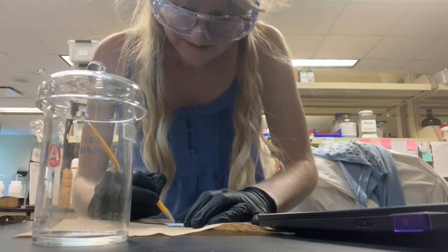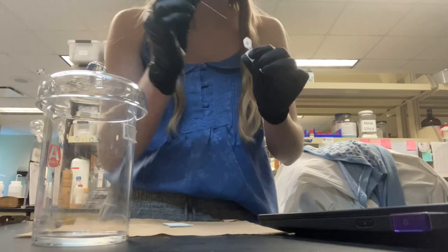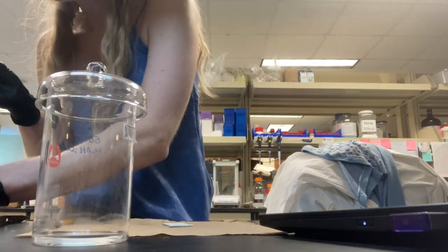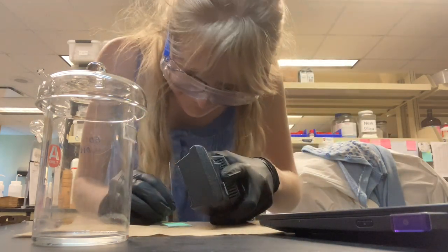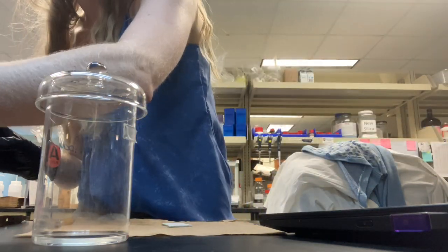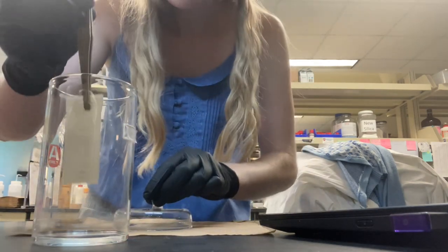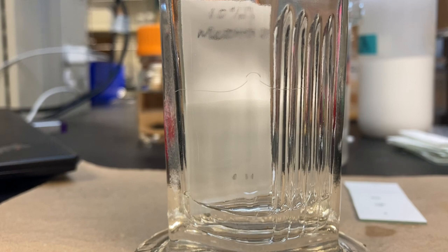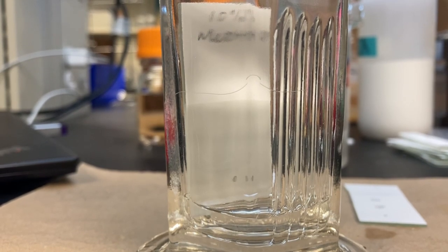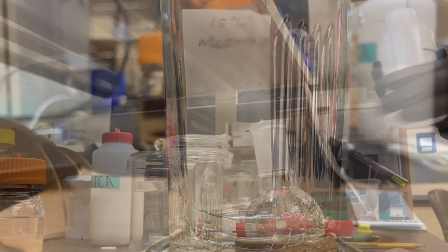In the afternoon, because my original plan failed, I had a crude product — a product that hasn't been purified yet — waiting in the freezer that needed to be purified through flash chromatography. Here I am double checking to make sure the spot is still at the same location it was when I tested it a few weeks ago, just to ensure it didn't degrade. It didn't, thank goodness, or that would have been really sad. This is what TLCing is: you basically spot your product onto a silica plate and wait for it to develop and resolve.